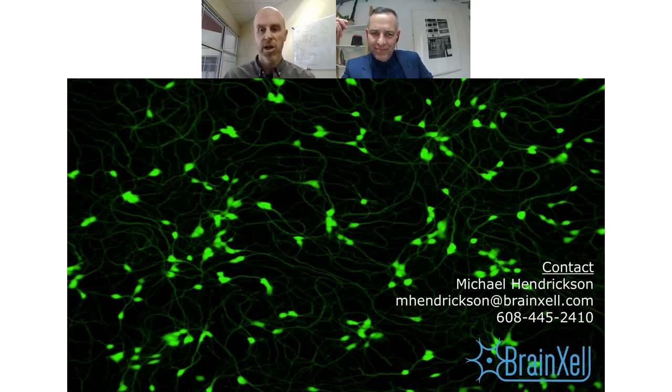However, in general, if the iPSC quality is high, that means they're self-renewing and they're not spontaneously differentiating easily. So if that overall quality is high, typically the differentiation goes well. So we don't often see what we would consider overall high quality iPSCs have a failure to differentiate well. So it's the overall quality typically that leads to high quality differentiation.